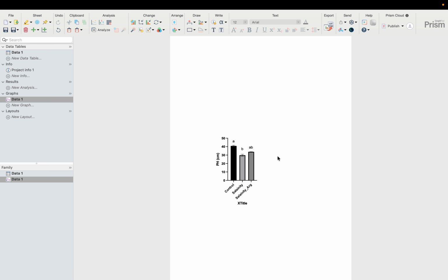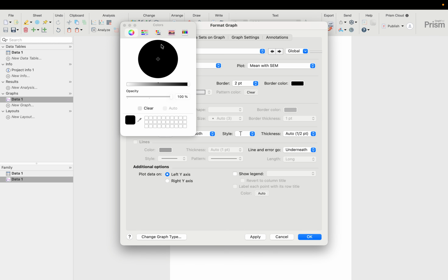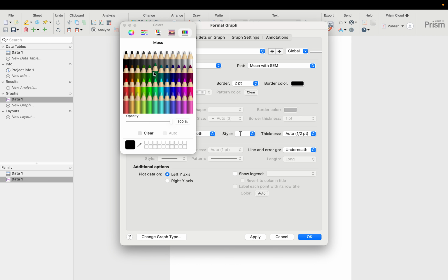Right, so by this way you can put later here, and then you can change the shape. For example, you don't need the x-axis, so I want to change the color of this graph, so click here, and then this one is control, salinity and arginine, so I want to change the color of control. Then the field graph, come here, so we need a different color, not this one. You can choose a different color, like this one we need.